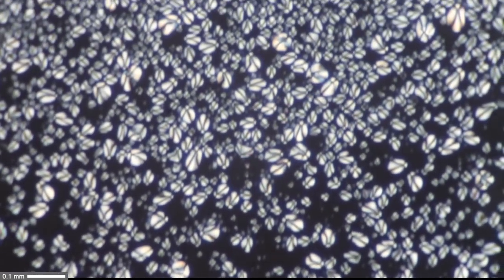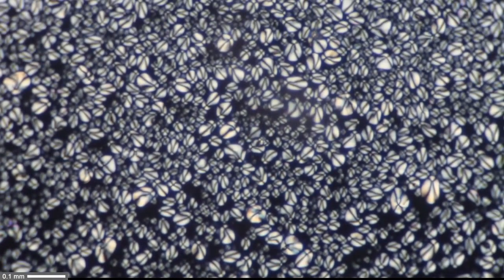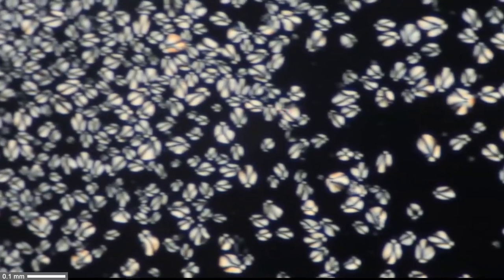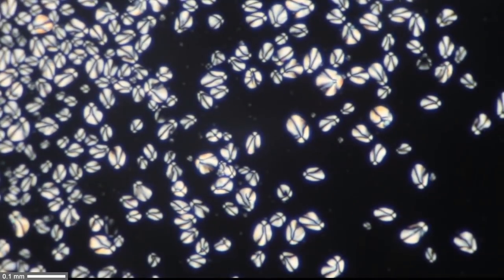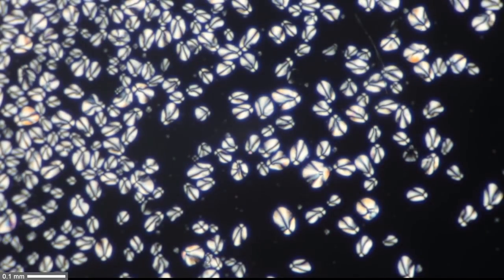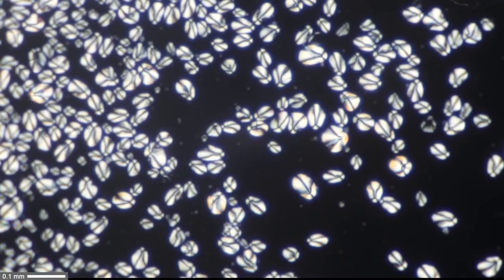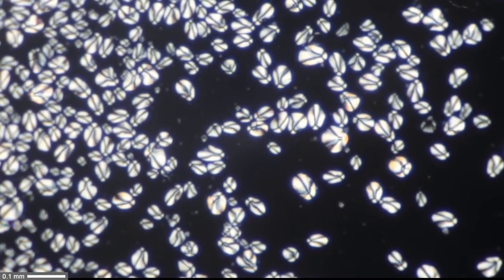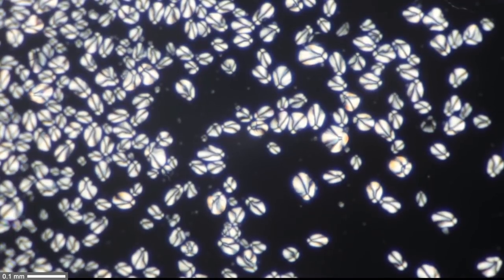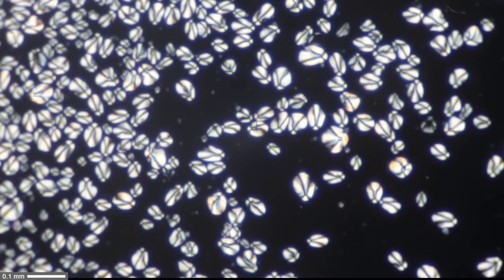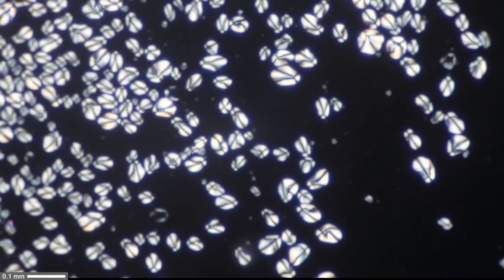That's basically at a 10 times magnifying objective and I always turn the polarizing filter a little bit to make sure that the background is nice and dark. At another place you can see that the starch grains have this very small cross-like appearance in them and this is because the starch grain is polarizing.